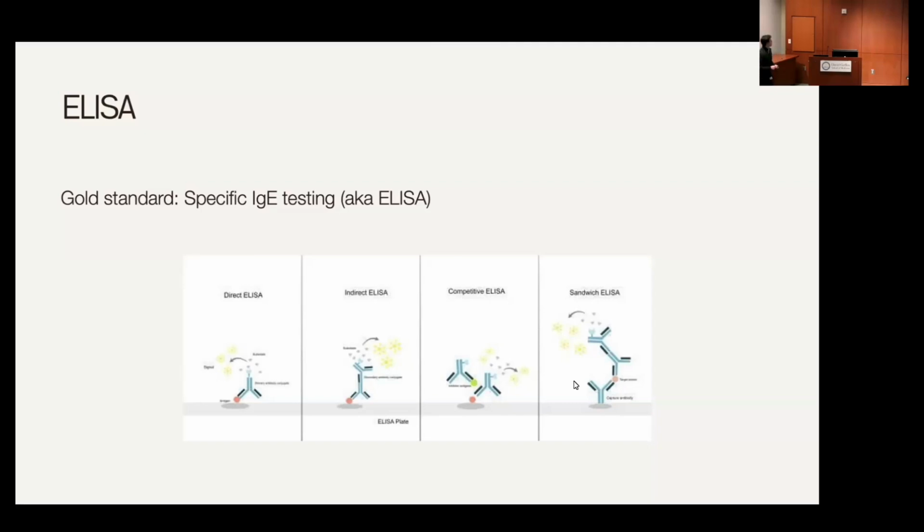What makes them special is that they're able to interact with different substrates to either change color or emit some kind of light that can be detected on spectrophotometry. And usually the substrate is colorless, so it's really easy to detect these changes.